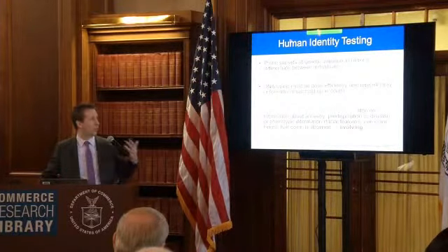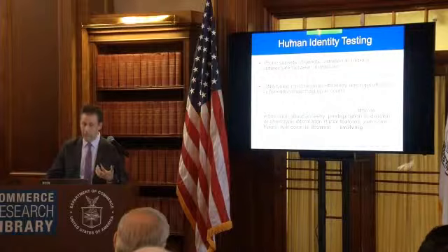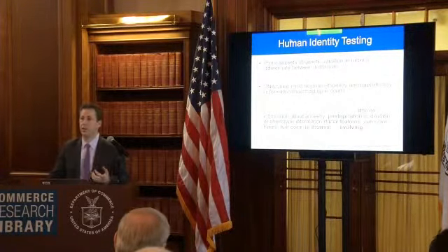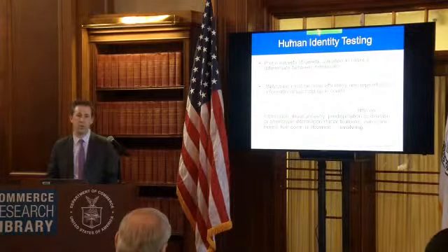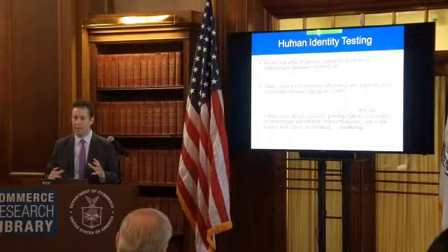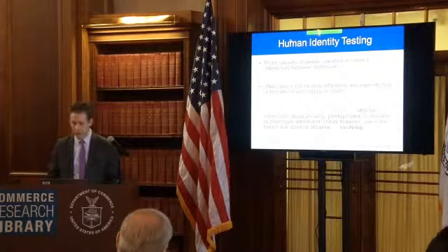This information must hold up in court. There are protocols, standards, and guidelines for doing DNA testing. Right now, there are over 13 million profiles in the national FBI database. These are all done with similar techniques, standards, and guidelines. So you have this harmonization throughout the US of how the typing is performed. You don't have individual or rogue laboratories doing their own method of testing or looking at their own markers. It's all very systematic.